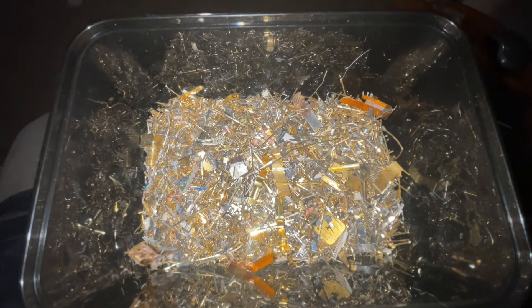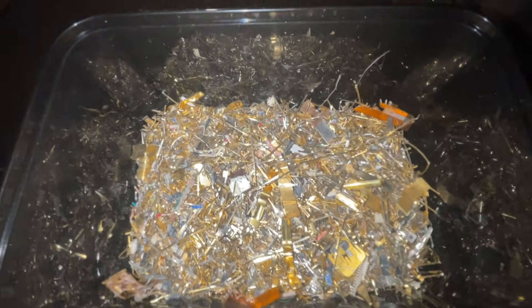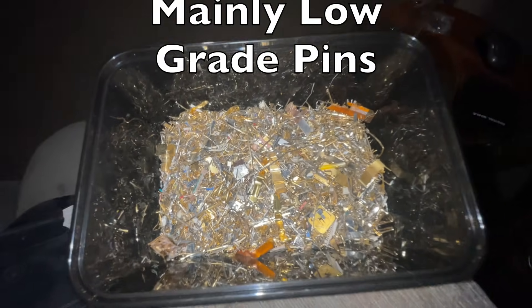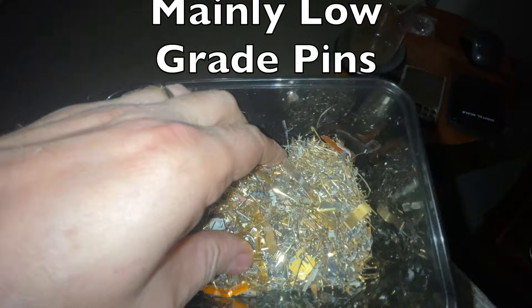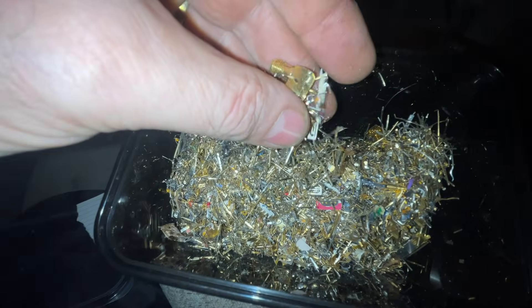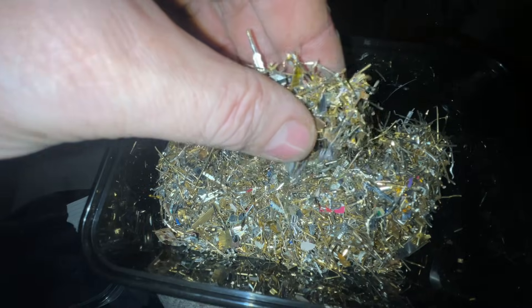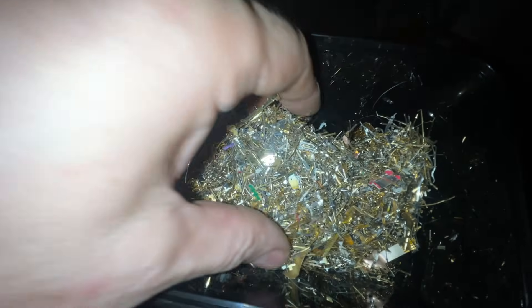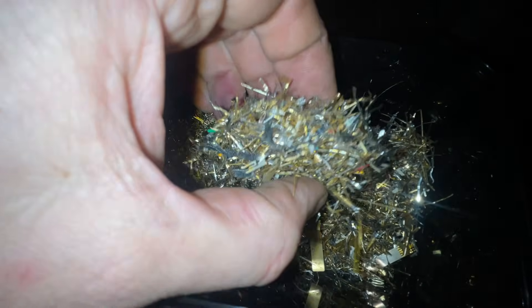I've got 600 grams here of mixed pins — some are good quality and some are rubbish. We're going to put this in acid and see what we get. There's a lot of it. I'll put this in nitric and see what we've got.